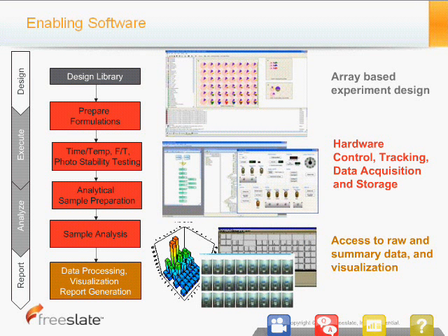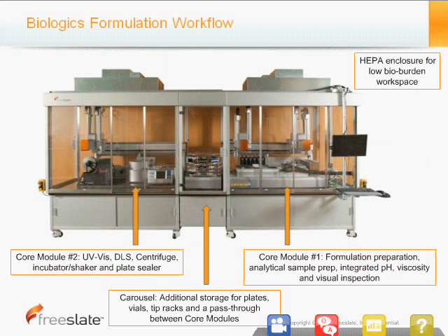Next slide. So the system that we've assembled for doing this, we call our Biologics Formulation Workflow.